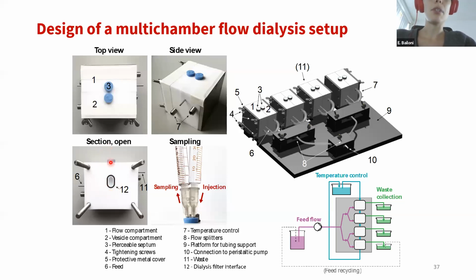On top of the chamber is a pierceable cap that allows sampling and injection. And this happens via 2 syringes, as is shown here. So again, we want to be very mindful that we don't introduce air bubbles at any time. And this is so important because air bubbles will create a volume change in the chamber that is detrimental to the measurements. So every time that a sample is taken, an equal volume should be injected into the cell.